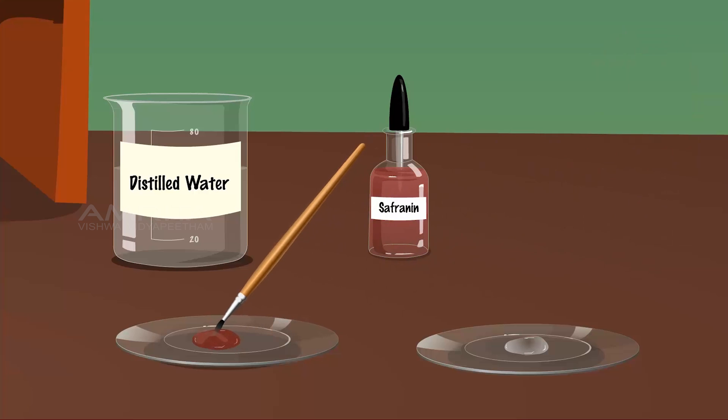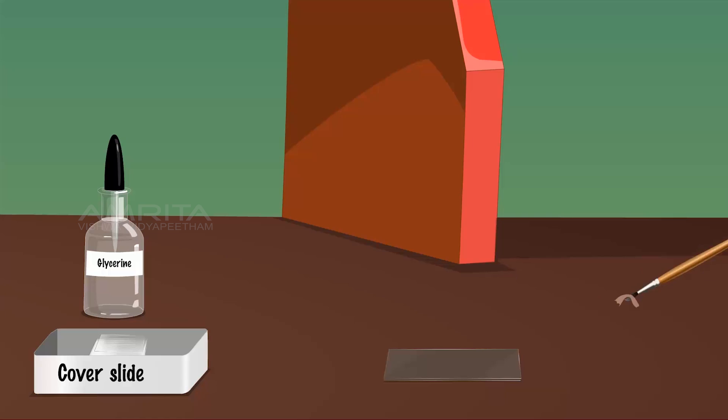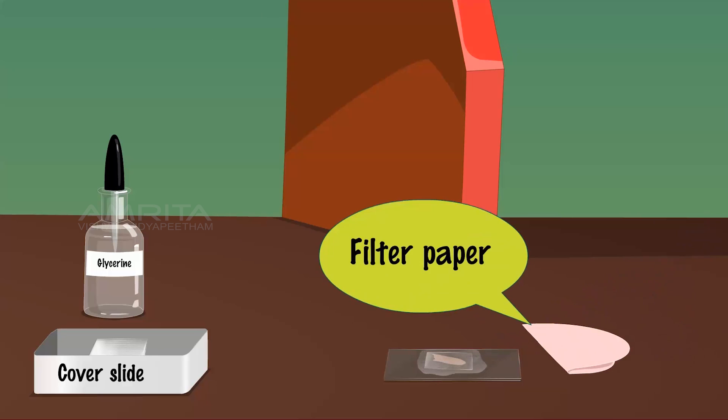Remove the excess stain sticking to the peel by transferring it back to the watch glass containing water. Transfer the peel to a clean glass slide using the brush. Take a few drops of glycerine using a dropper and put it on the peel. Using a needle, place a cover slip over the epidermis gently. Use a blotting paper to soak up excess glycerine.